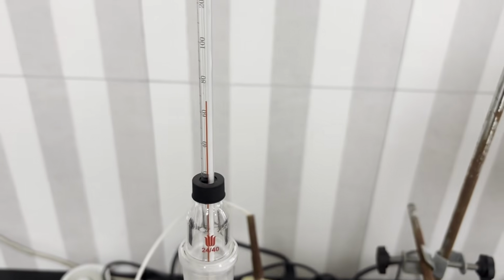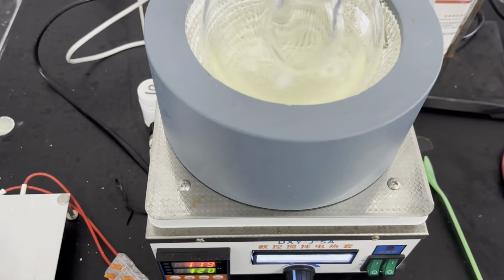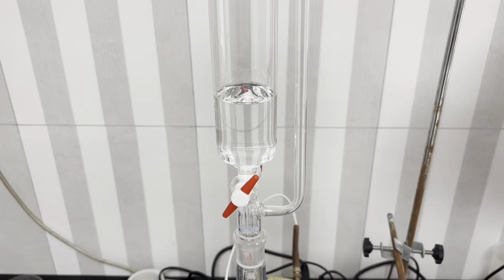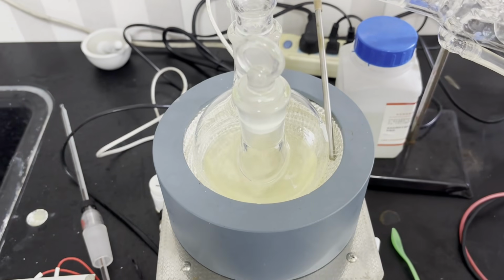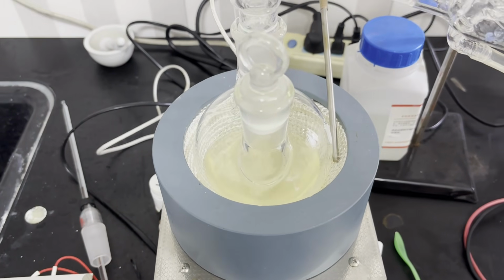After half an hour, the readings on the thermometer increased considerably higher than 60 degrees C, meaning that nearly all diacetone alcohol is decomposed, so I temporarily turned off heat and stirring. I then assembled a dripping funnel above the flask and filled it with more diacetone alcohol. By gradually adding diacetone alcohol to the flask, a continuous process is achieved, where temperature is never let above 60 degrees C, so minimal water distills over, improving the purity of our acetone product.